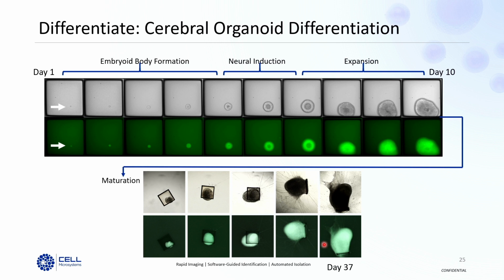Because we're seeding in an ECM type suspension, the workflow is really straightforward. So the fluidics wouldn't necessarily help us because the workflow is already very streamlined itself. Also, we're not dispensing into each of the individual microwells one at a time. It's a reservoir into which we dispense that volume, and it distributes itself evenly.